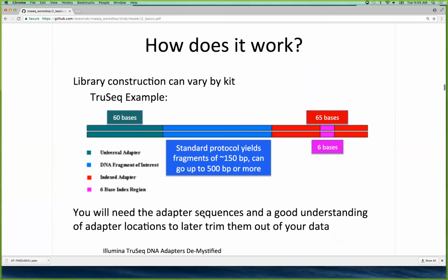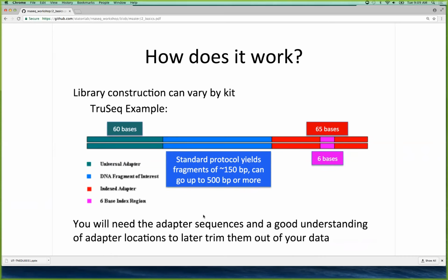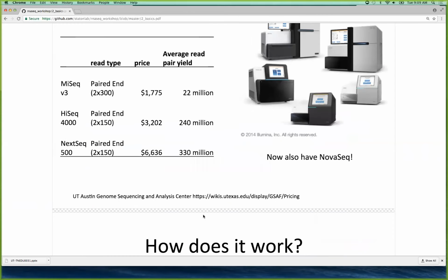How many RNAs are there per cell? That's a good question. There are single cell transcriptome preparations, and I don't think you would sequence it on a HiSeq. I think you would put it on a MiSeq, and if you could do PCR free, which would be hard with the single cell. Just estimating ballpark, is 20 million enough to get a sense of what the expression is from the cell? 20,000 genes.